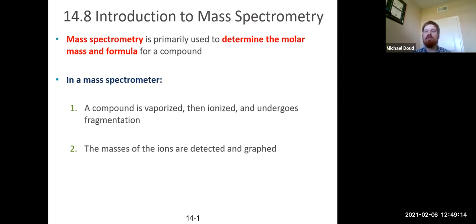Once we finish all of that, we're going to go through a little step-by-step process to solve these combined spectroscopy problems. By the end of it, if I give you a mass spectrum, an IR, and an NMR, either proton NMR or both proton and carbon 13 NMR, you should be able to tell me what the structural model is, with reasonable limitations. If I give you that type of problem, you should be able to analyze those spectra and come up with a structure. So that's going to be our goal for this week.